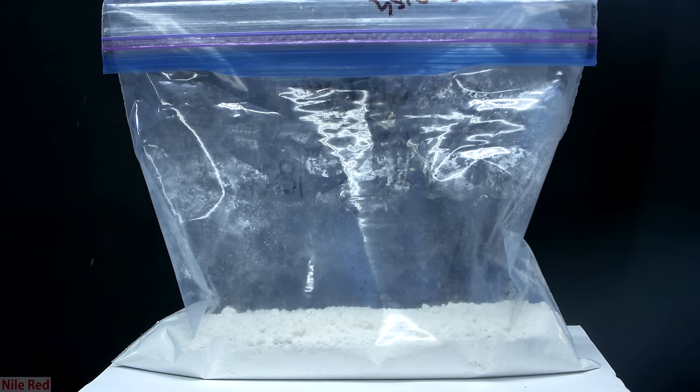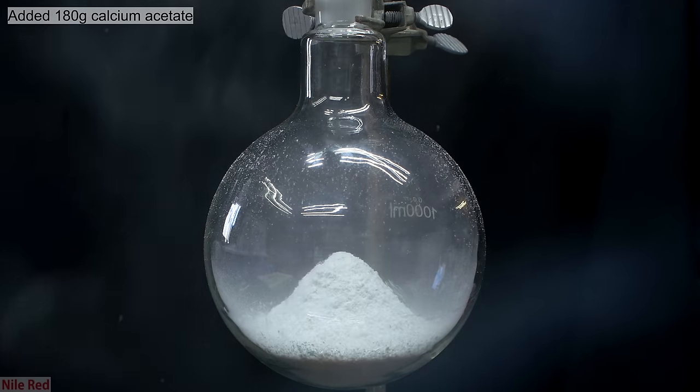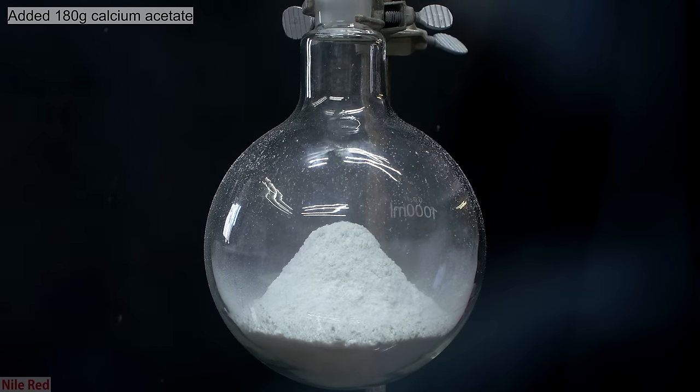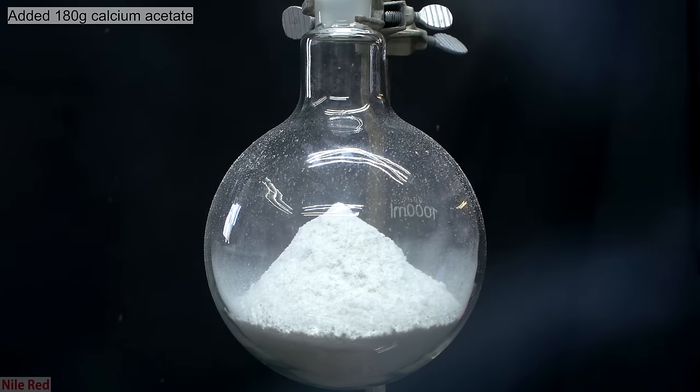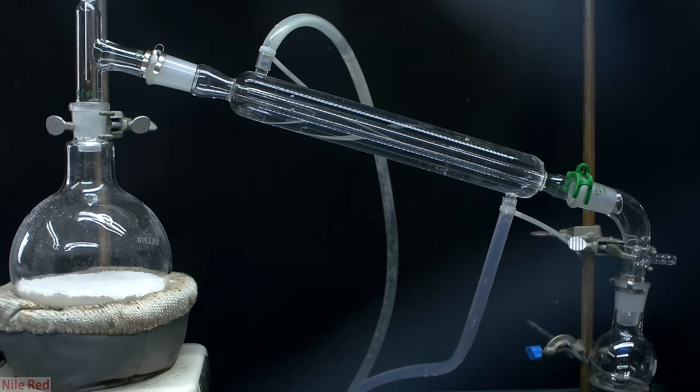The only ingredient that we need for this preparation is calcium acetate, and I'm using 180 grams that I produced in a previous video when I made calcium acetate from Tums. Very simply to start off, all of the calcium acetate is added to a 1-liter round bottom flask. Once everything's been added, I shake the flask to level out the calcium acetate and I set it up for distillation.